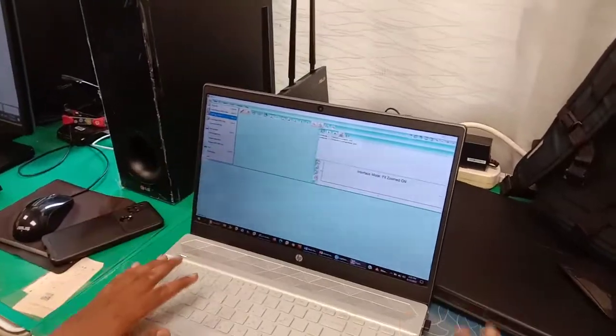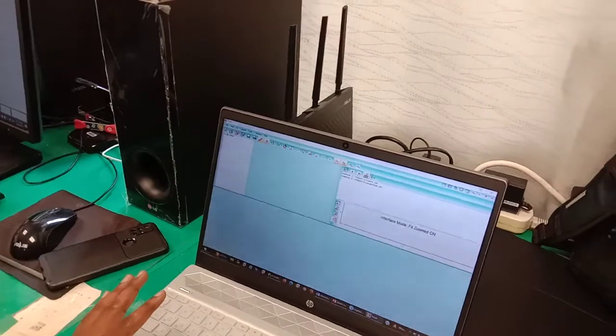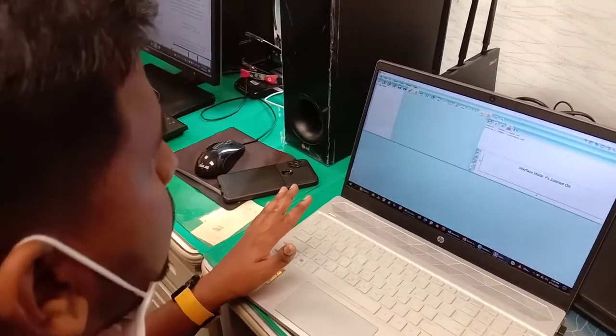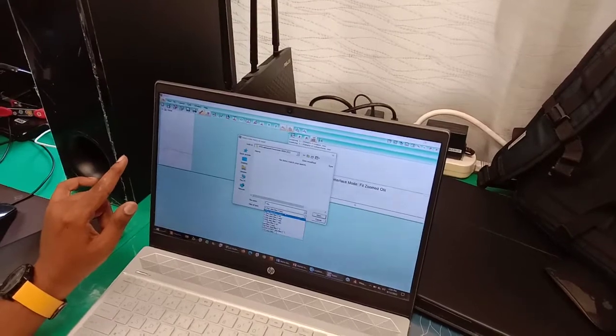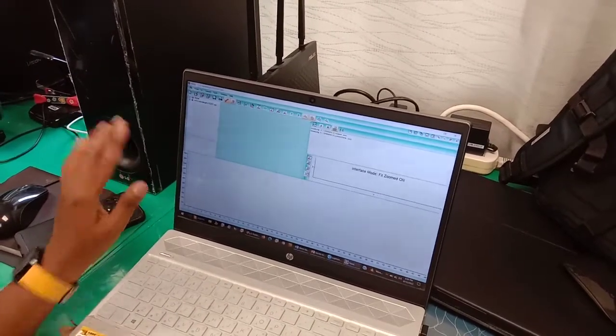How to input your scan files, right? So first you have to input your scan file, because in synchrotron we measure the files in the format of XYE. So you just go, say load scan files, and navigate your folder, then change the files of type as XYE. Then you can see your one, then choose it out.